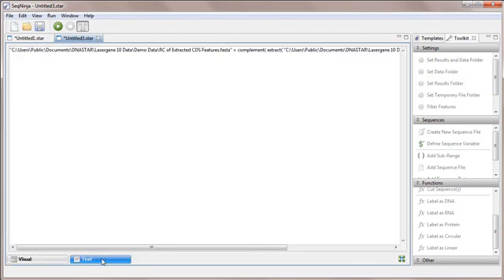The text view contains the same information as the visual view, but in plain text. Advanced users may find it convenient to type or paste text into this view compared to using the visual view.